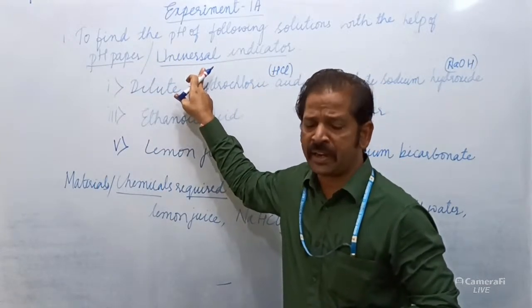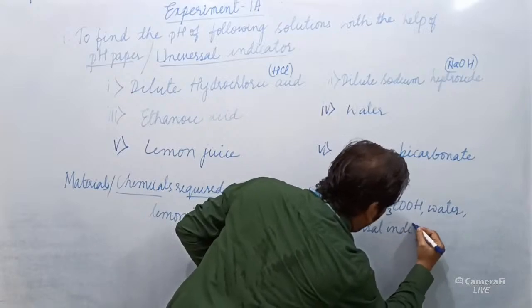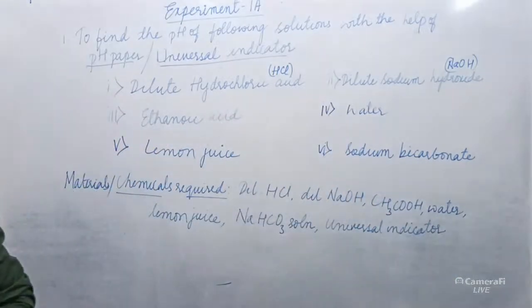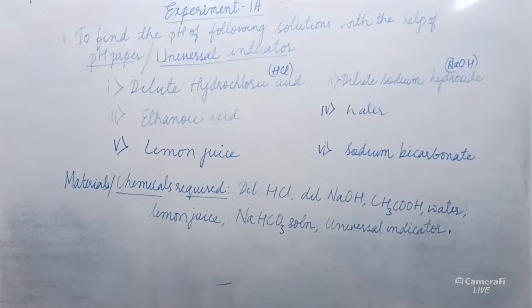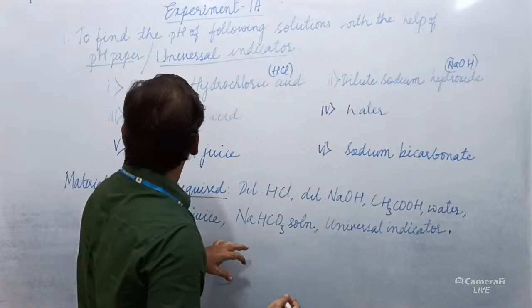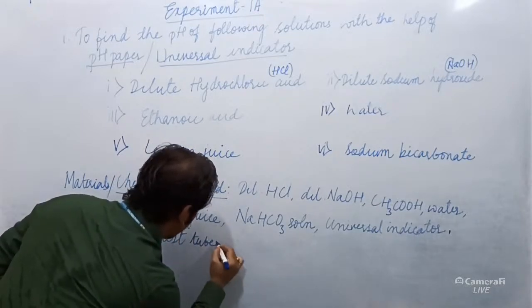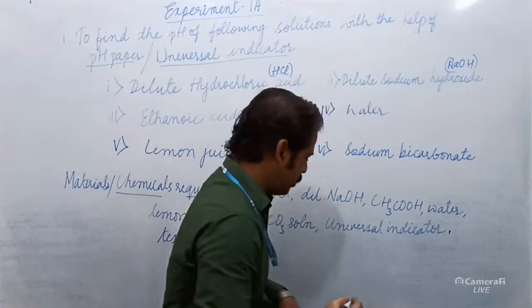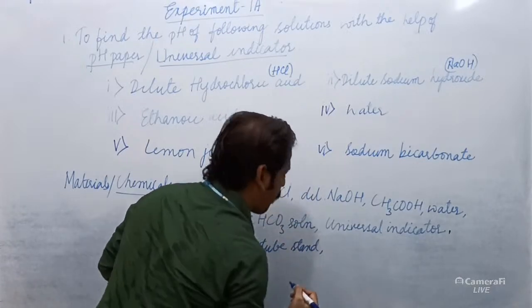I am using universal indicator here. We also need test tubes, a test tube stand, and a test tube holder.